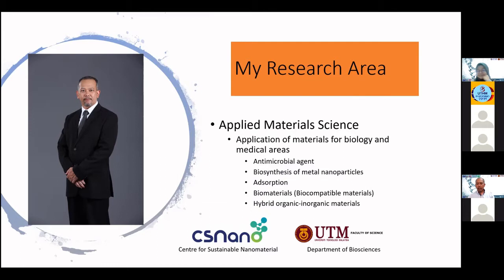So in the Department of Biosciences, we have a lab and facilities to synthesize the material, and after that, we straight away analyze this material for biological applications, such as antibacterial assay. We can do antibacterial assay here, antifungal assay, antioxidant assay, and also cytotoxicity assay. The toxicity involves cell culture. Okay, so this is actually my strength.